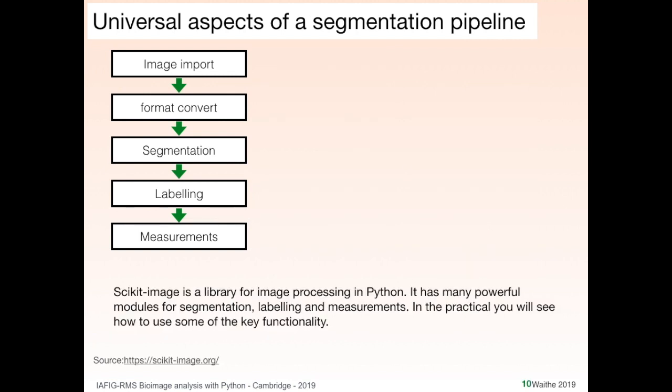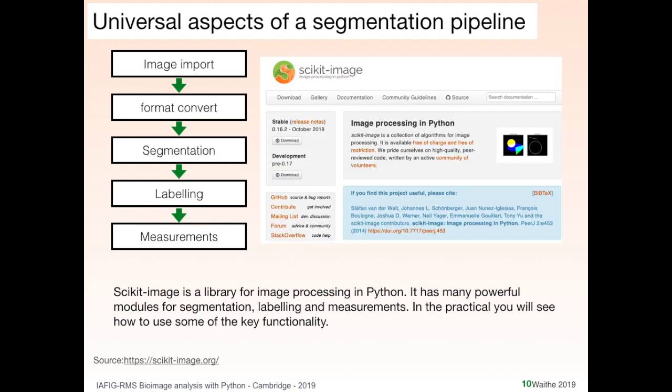That's fine. So scikit-image is a great library for basically doing all of these steps, because you can program all of this in raw NumPy or in original Python, but this has a lot of functions which make life a lot easier. You don't have to write your own flood fill algorithm to convert these foreground and background regions into independent cells.